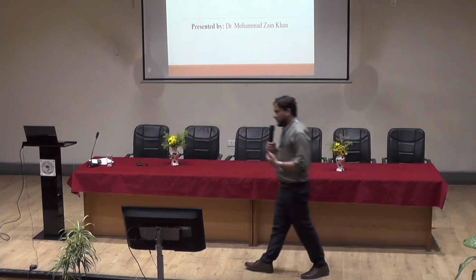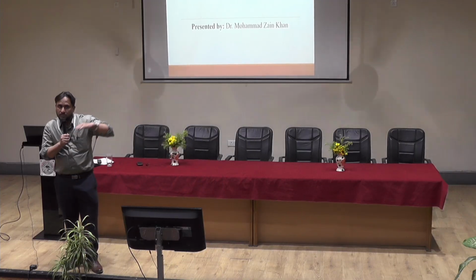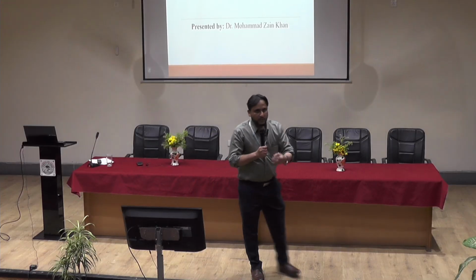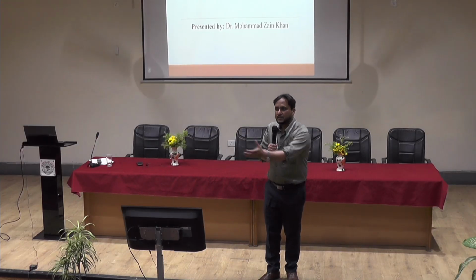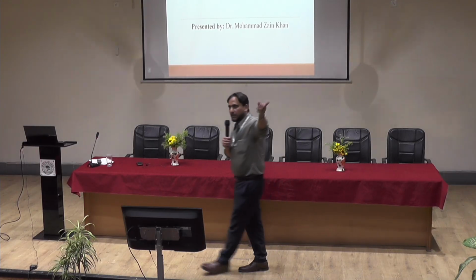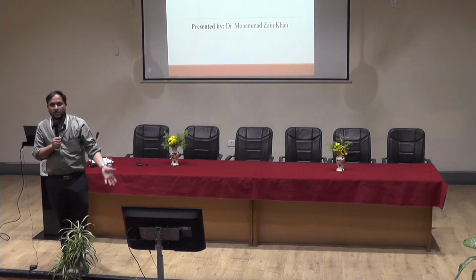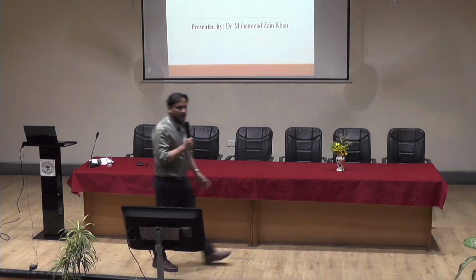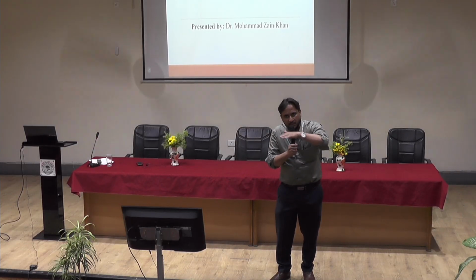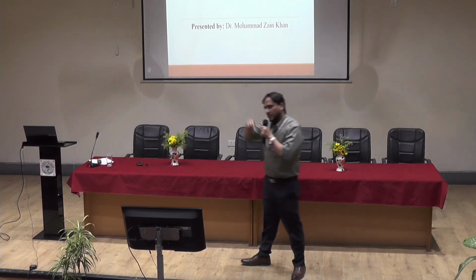If the material is very, very crystalline, as you all know, crystalline materials have very good structural arrangement. If I ask you when you enter the class, I give you enough time to sit accordingly, then this type of arrangement which I am seeing right now, it is a crystalline arrangement. The way you were standing for lunch, that was a type of amorphous arrangement where there is no regular pattern, no regular order. Similarly, depending upon the nature of the material, if the material is crystalline, the layers are properly arranged, we get sharp angles and sharp peaks.